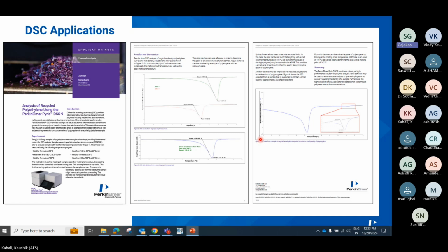And this might be very critical for some kinds of plastic, because many pharmaceuticals are using this plastic for the storage of drugs, and we see a lot of plastic bottles coming for cough syrups and all these things. A lot of our food material comes in plastic containers. So this criteria is very important.